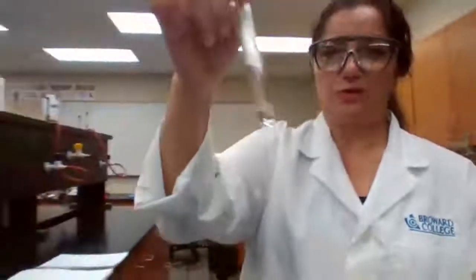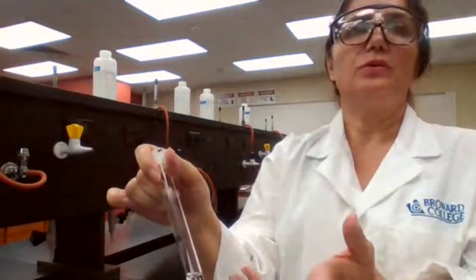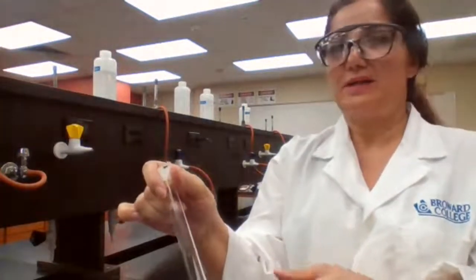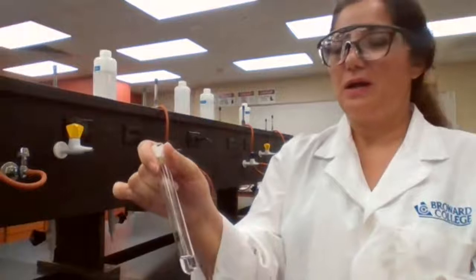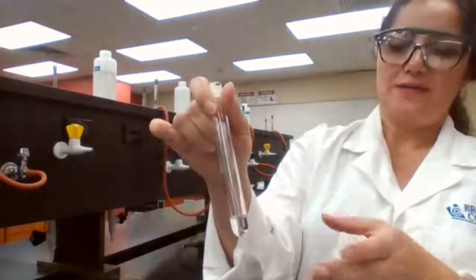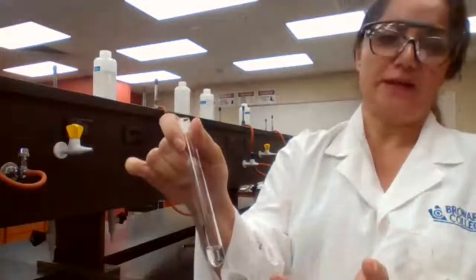It formed crystals. So dissolving ammonium chloride in water, you can then decide based on the observation at these two different temperatures if this is an exothermic or endothermic reaction.